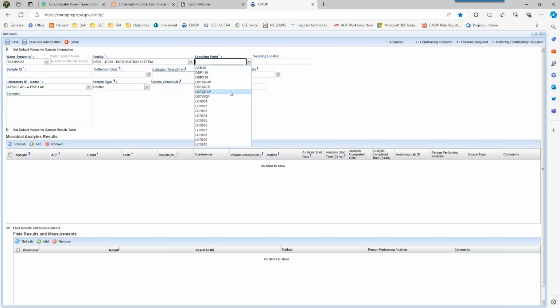All right. And here we have SP for special. And I will just say something like, that's my code. And again, we can name our sample something to help us remember that it is the special. So I'm going to say TCRSP.